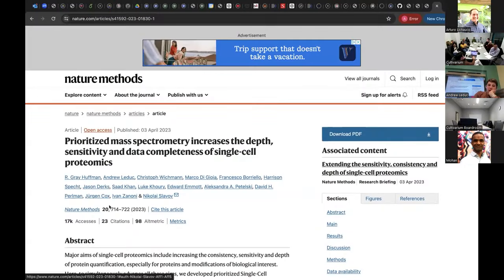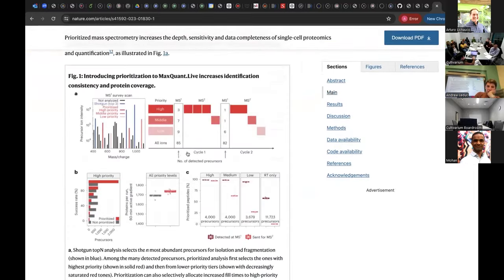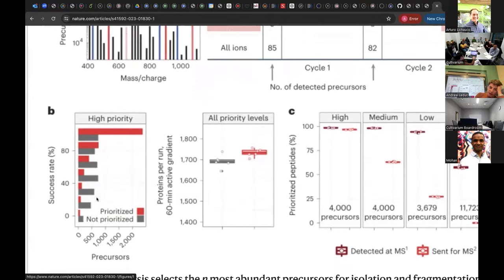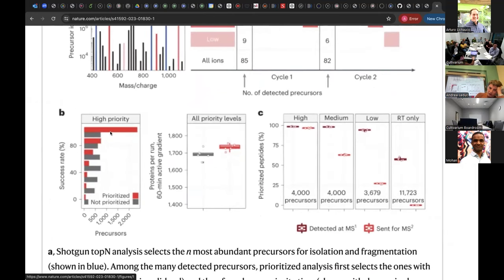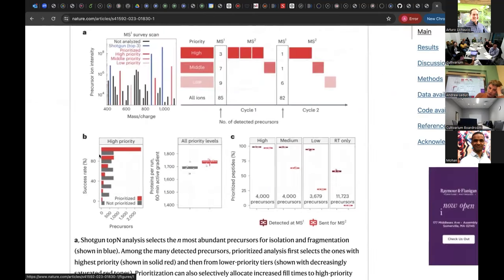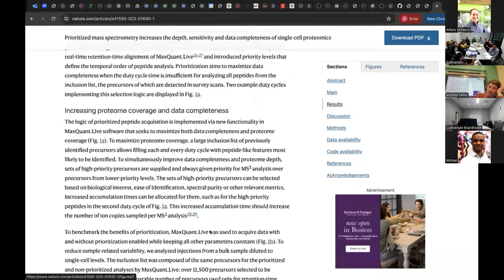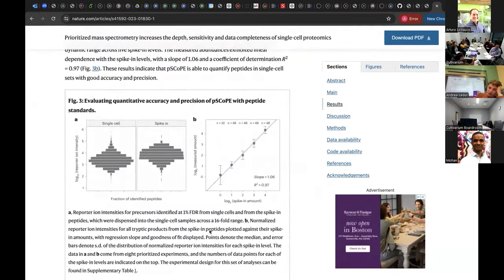Okay, so here's the paper for the prioritized mass spectrometry. By the way, someone asked about inclusion lists versus MaxQuant Live. We found that the prioritization improved performance over a regular inclusion list without the prior. This is too complicated to explain here, but you can see it in the paper. But your question about spike-ins.